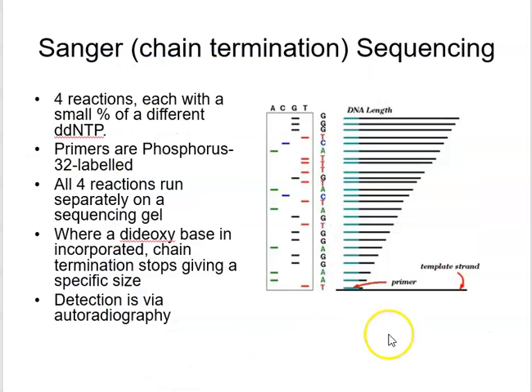So this explains how the dideoxy chain termination sequencing works. We start our DNA replication on a piece of DNA. We'd supply a test tube with a piece of DNA that we wanted to sequence. We have a primer, a short DNA strand that creates a double-stranded region of DNA for DNA polymerase to start from. That would have a 3' OH group attached, and DNA polymerase will be able to extend from that. So this would be the primer on a template strand.